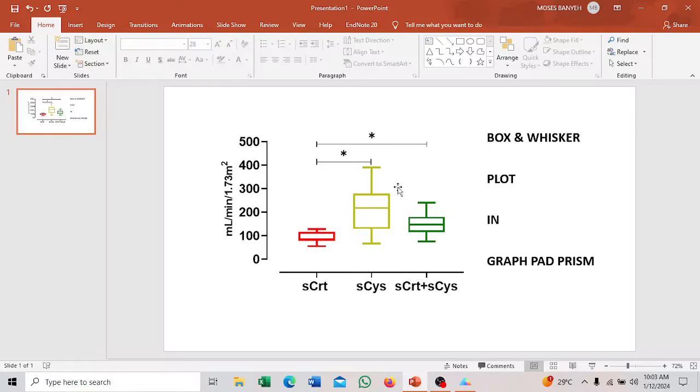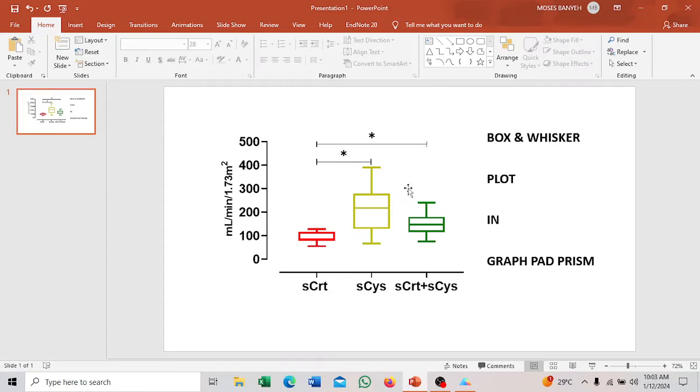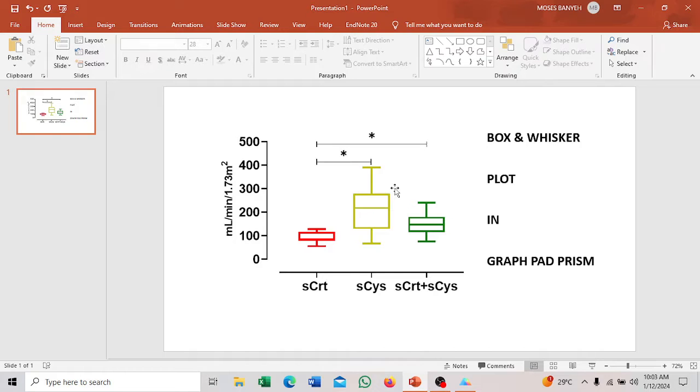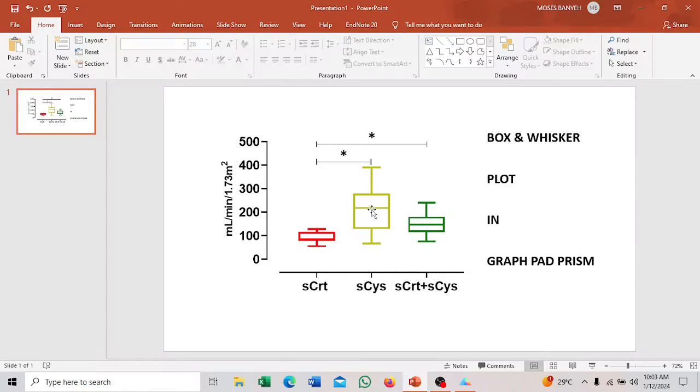Especially if the data is non-parametric, you might want to use the box and whisker plot to display the comparison. So how do you create this in GraphPad Prism? That is what we want to look at in this video. This is what we want to create, the box and whisker plot in GraphPad Prism.